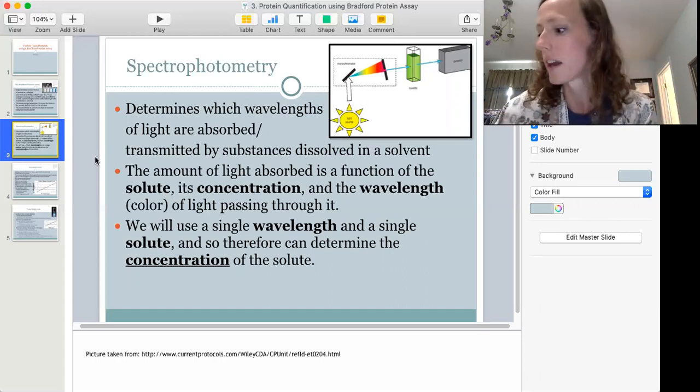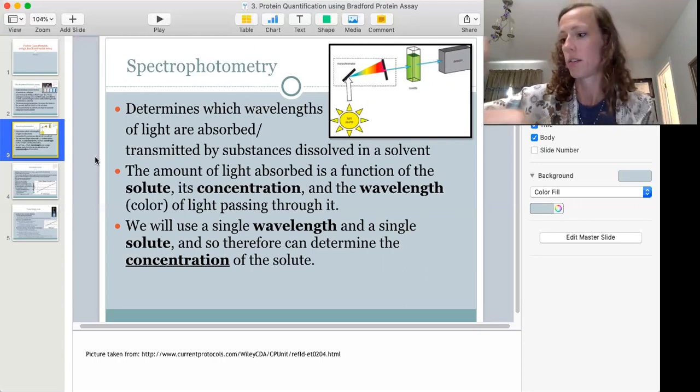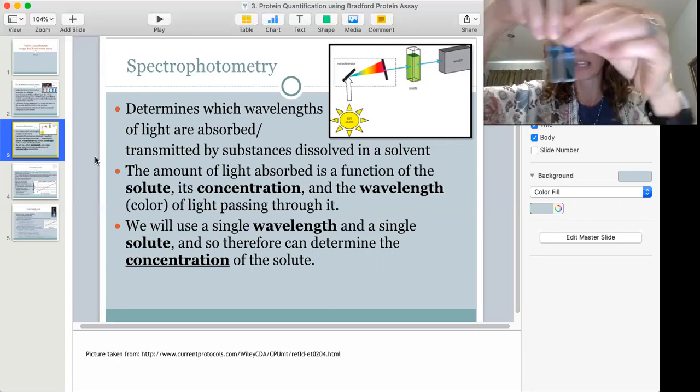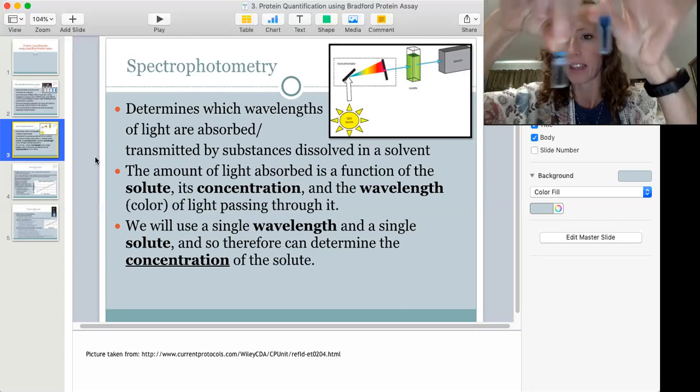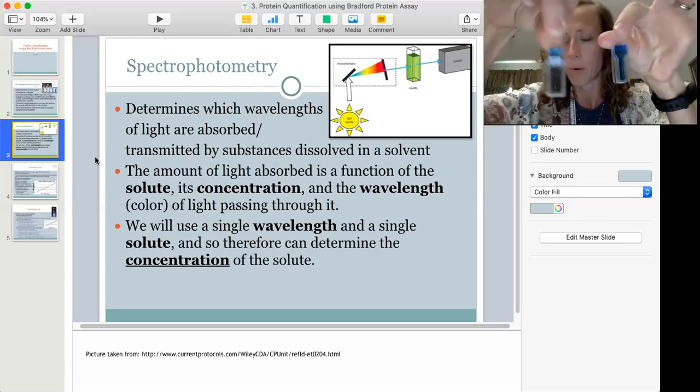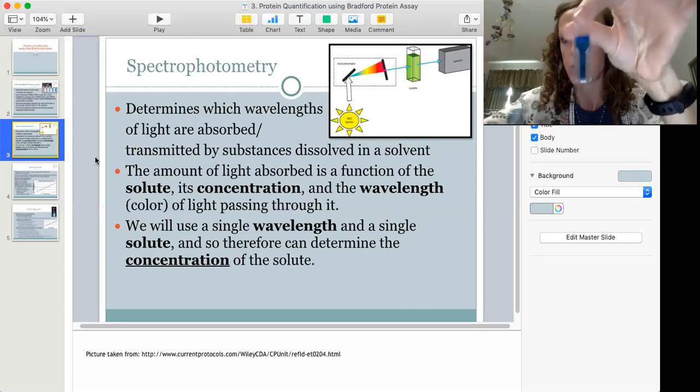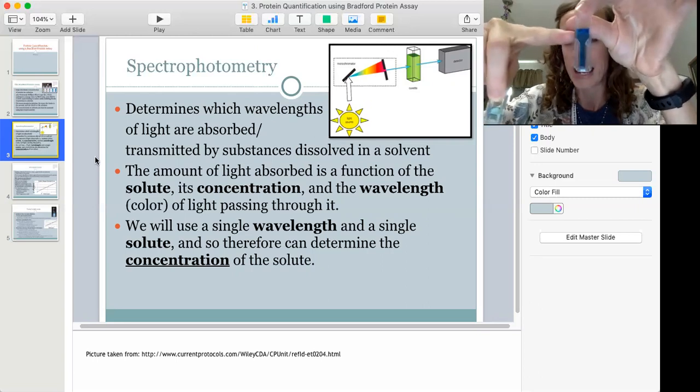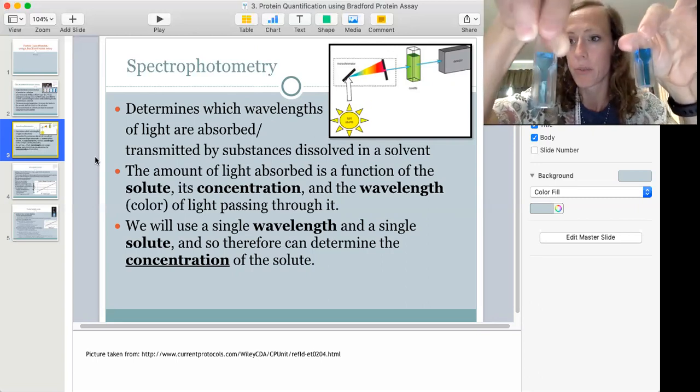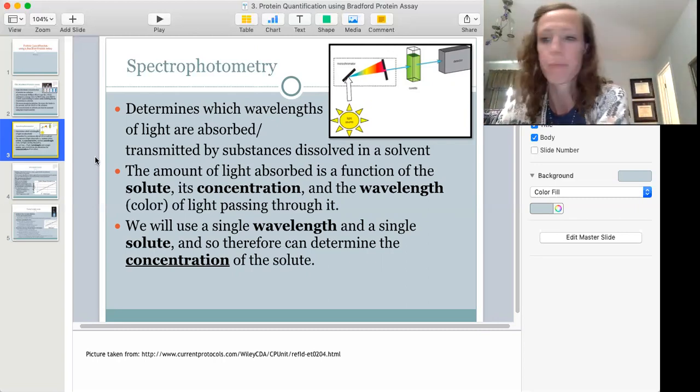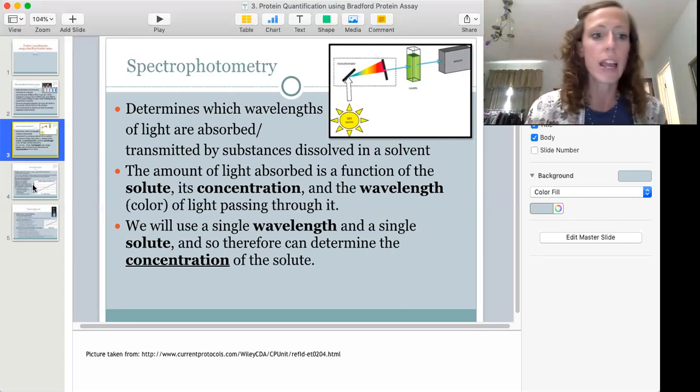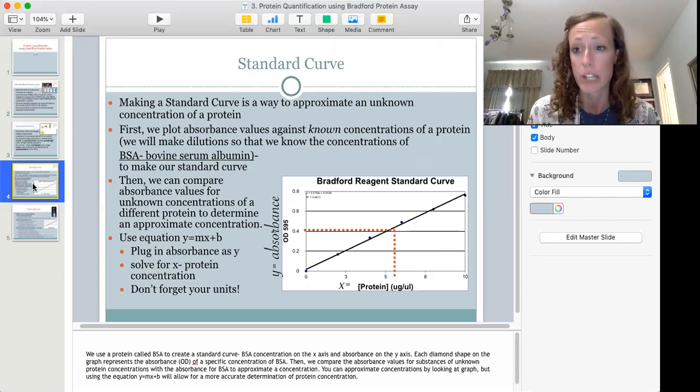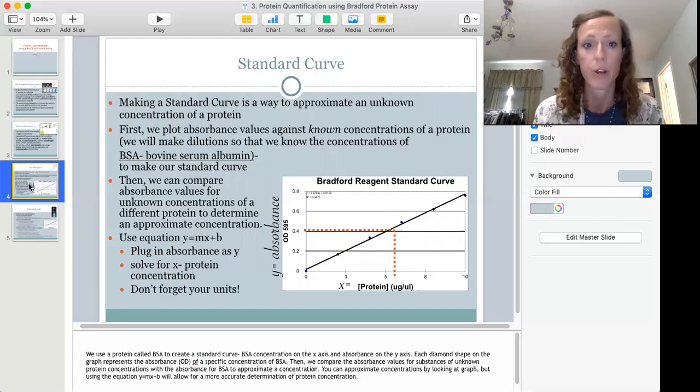So I'll show you a little example here. We can see here in our cuvette, I've got one solution that has a slightly more blue and a more paler blue. So if you put this one in the spectrophotometer, the absorbance value will be higher than if you put this one in. So what you get then is with an increase in protein concentration, we should see an increase in absorbance values. And we're going to use that concept to create what's called a standard curve.